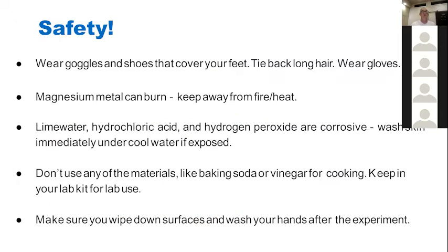Really important, since we're doing acids and burning things: wear goggles and shoes that cover your feet, tie back your long hair, wear gloves. Like I said, magnesium burns. You don't want a magnesium fire in your house. It burns really, really hot, and if it gets on your skin, I don't even want to think about it. Lime water is a caustic base. Peroxide is somewhat corrosive. Hydrochloric acid, we know, is corrosive. You don't want those on your skin either. So wash up and clean up your space afterwards.